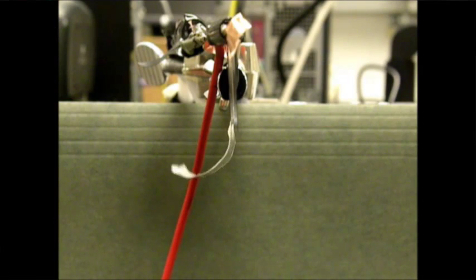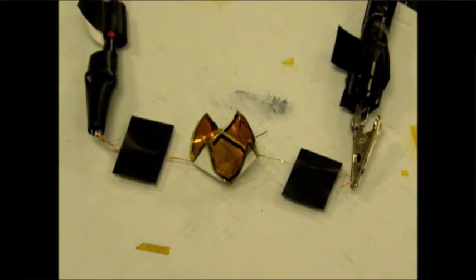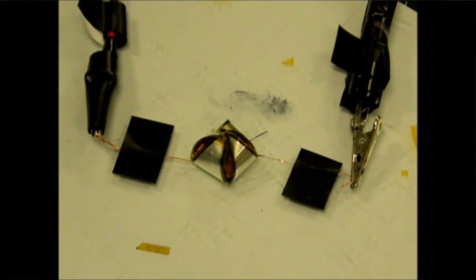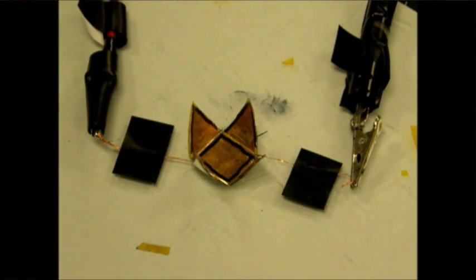EMC Lab stands for Electroactive Materials Characterization Lab. It's an experimental facility focused on the discovery of new materials. The idea is to enable through experimentation and theory the processing and design of materials that usually have functional ability in addition to being structural.